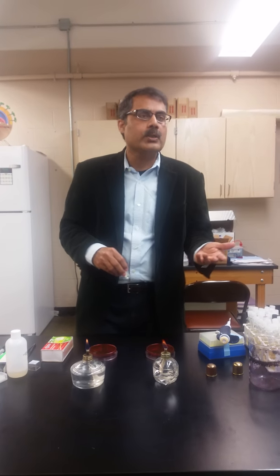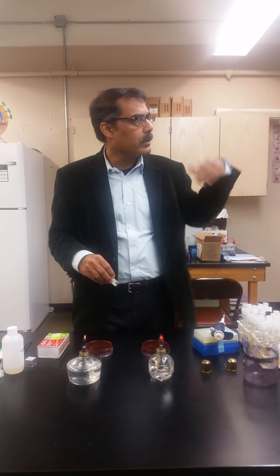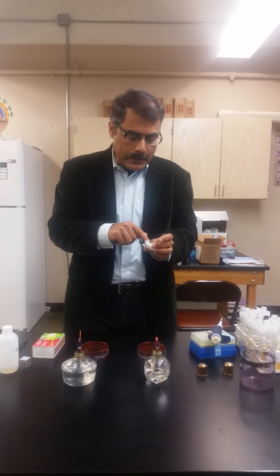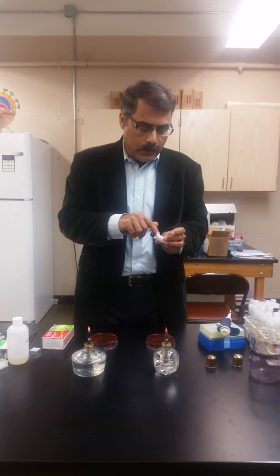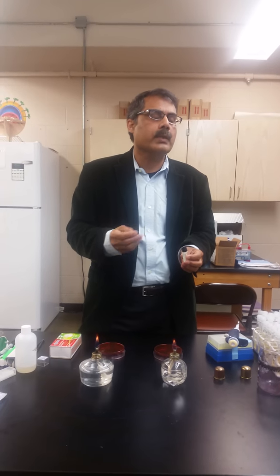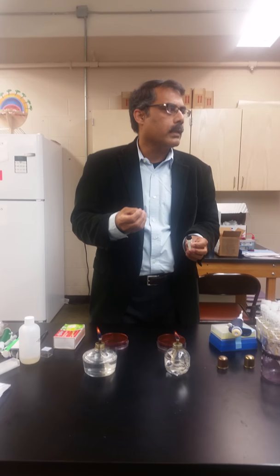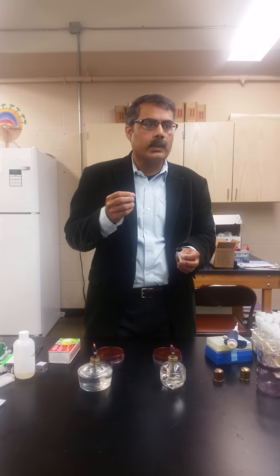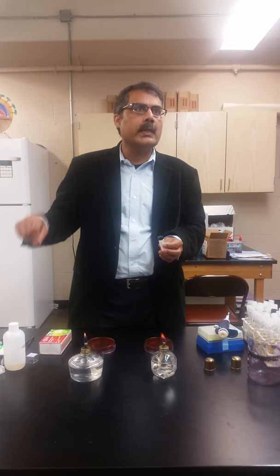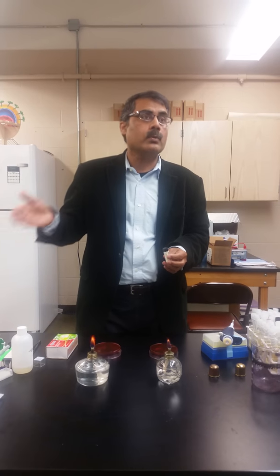So if there is a patient, you have to have a culture, in pure culture, basically. That's what I'm trying to say. From a patient, you have to have it in a pure culture, and once you have that, then you can screen it for its antibiotic sensitivity or sensitivity to other drugs.